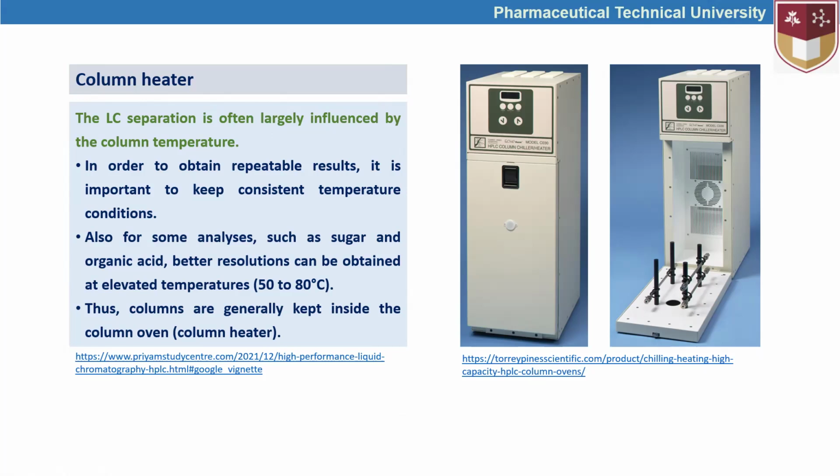So the temperature necessarily could be increased up to 50 or 80 centigrade in some cases. Therefore, the column heaters are very useful for those cases.